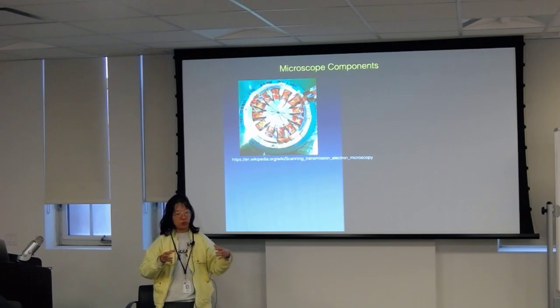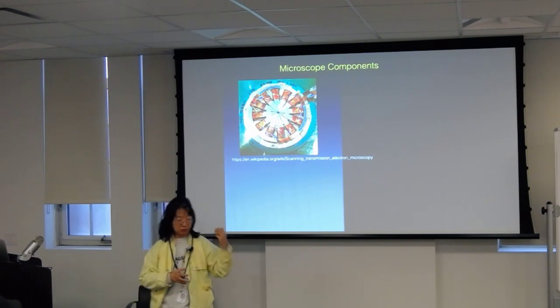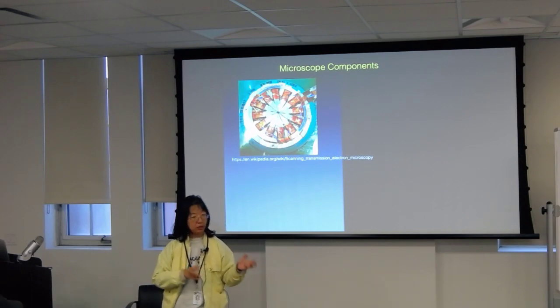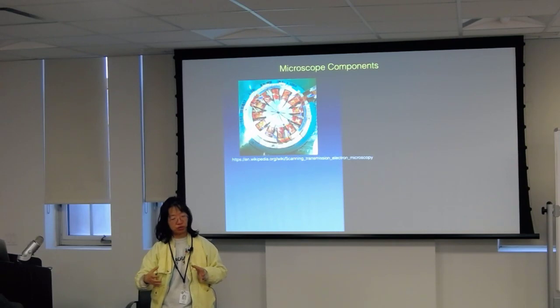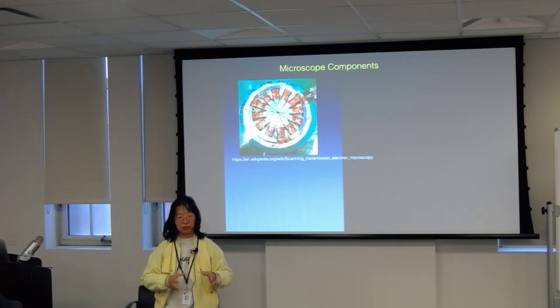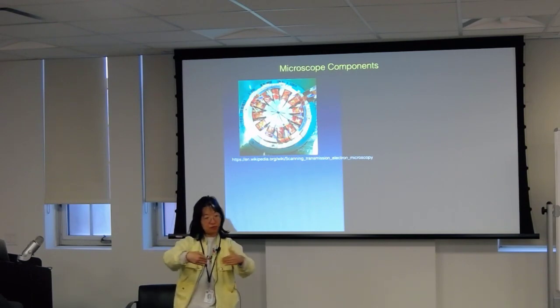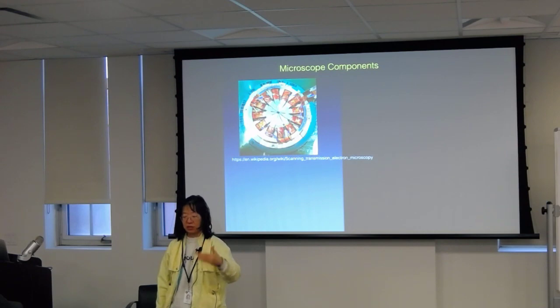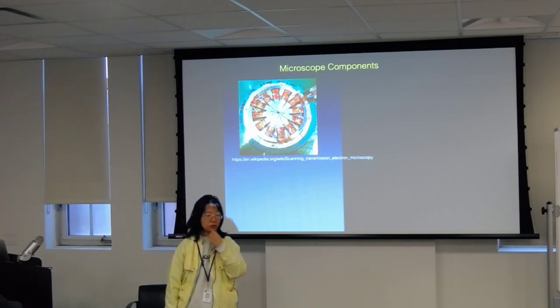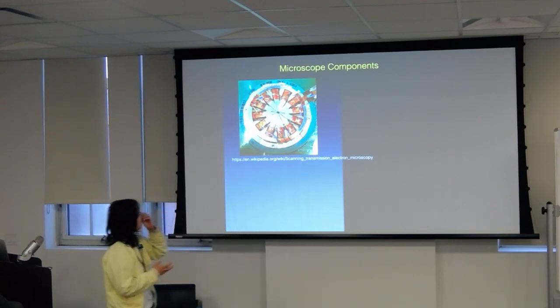And if you look at something like an F20 or a G2 100, they will have a quadrupole, so they can only do two-fold corrections. They cannot do three-fold correction. So-called three-fold correction is basically in 3 different directions to make that correction. And that makes it slightly worse when you want to go to really high resolution. So those are all the things that make differences in the different microscopes.